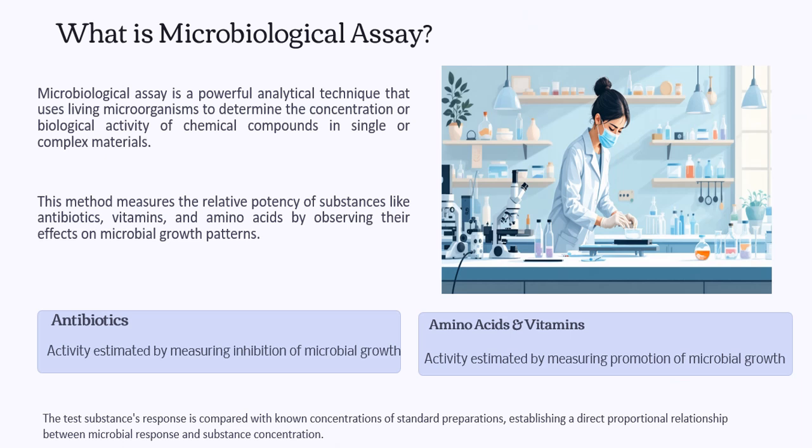The response produced by the test substance is compared with that produced by a known concentration of a standard preparation of that substance. Finally, the response produced by the test is compared with the standard, and this response produced by the microbial culture is directly proportional to the concentration of the substance under test.